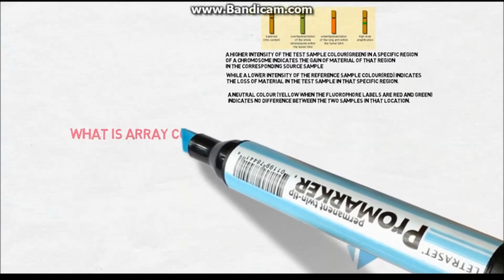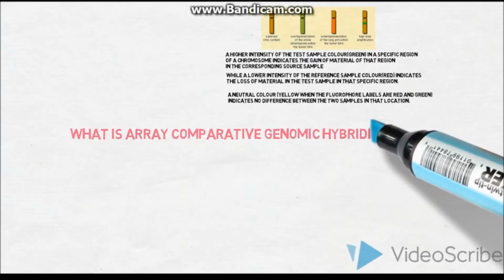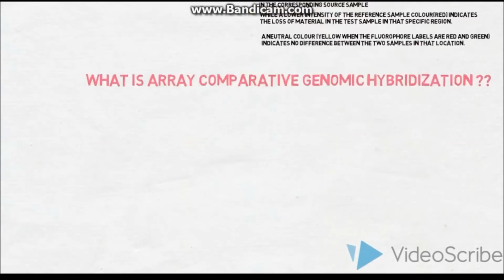Next, we move on to aCGH. So what is array comparative genomic hybridization?